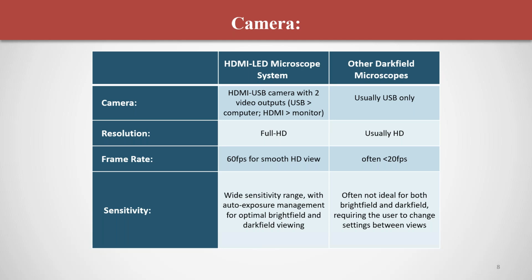If you have clients one after another, going from bright field to dark field, and at the end of the dark field you go back to bright field for the dry blood, between each of those you have to adjust the settings on the camera. It really isn't ideal at all. Not very smooth. The software of the camera is compatible with which computer systems?